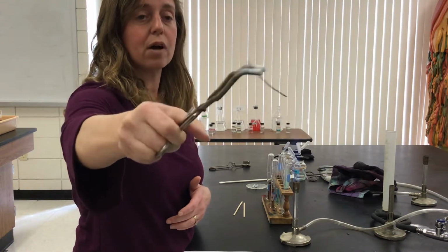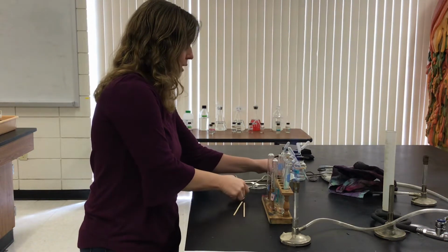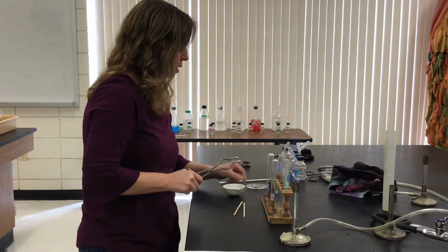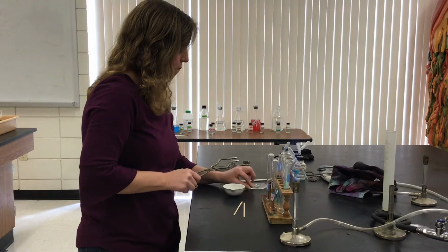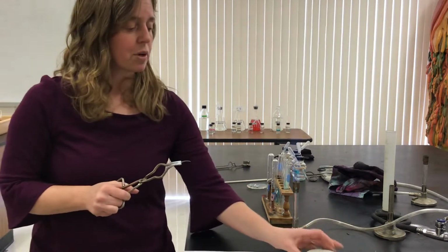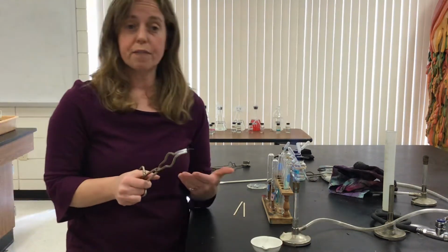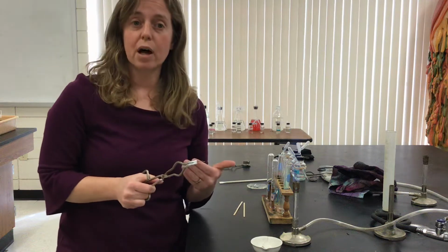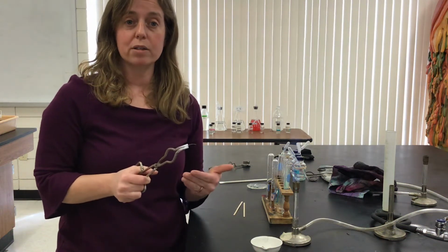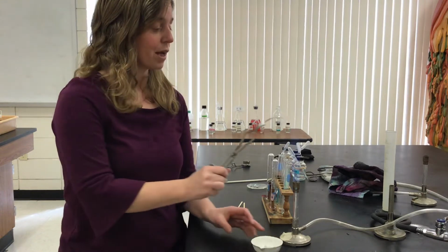So I now have copper oxide here. Now this next one I'm going to show you, you're going to like this one because this one's going to be extremely bright, okay? So this next one, you have Mg, so you have magnesium ribbon, and you're going to heat magnesium in a fire, which means you're mixing it with oxygen and you're making magnesium oxide, okay? So beware, this is going to be really bright when I put this in the flame, okay?